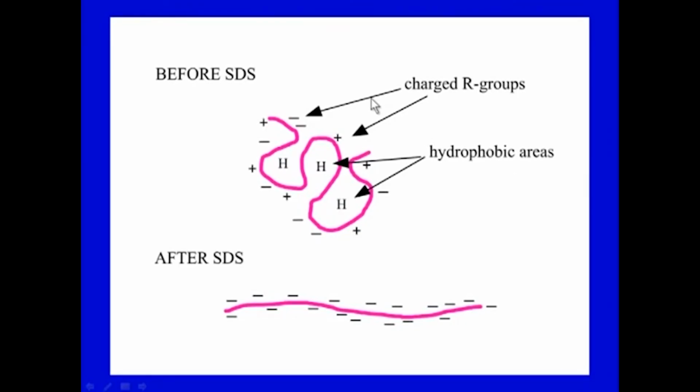So, as we were discussing, what happens to proteins? A protein is folded, it has interactions, so there are hydrophobic areas, there are other charged groups, hydrogen bonding, all those things. Now, when you treat it with SDS, the protein is extended and overall covered by the negative charge. Many times these proteins have different shapes, but now they are extended molecules, and heating also helps in that.